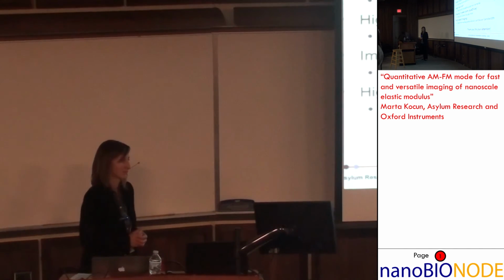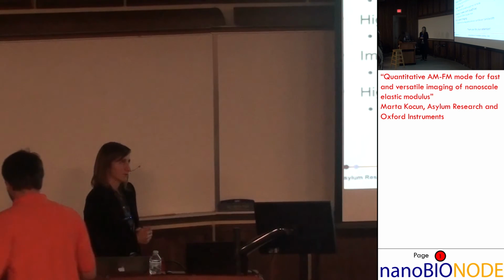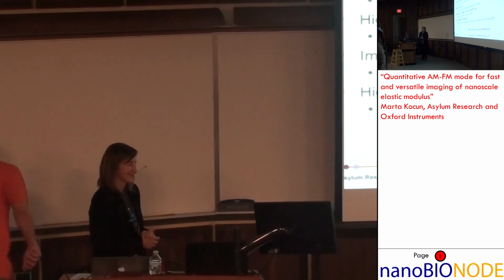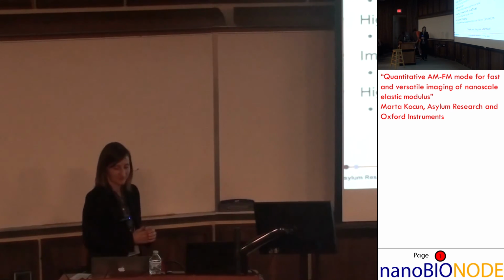All right, yes. For the AM-FM, does the blueDrive give you anything? I'm not talking about in water, I'm just talking about in air. Does it give you any value as far as AM-FM versus just mechanically driving those two frequencies? The question is about whether photothermal excitation is better than mechanical excitation in air for this specific application.